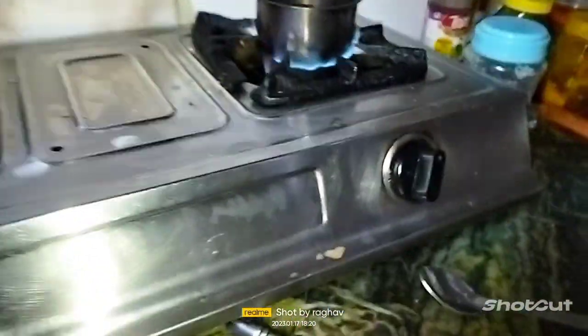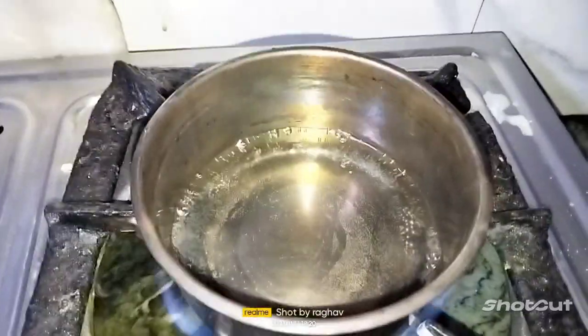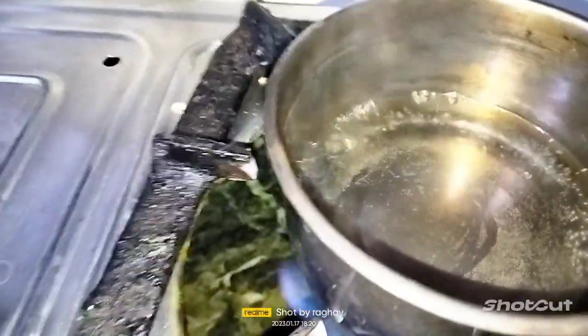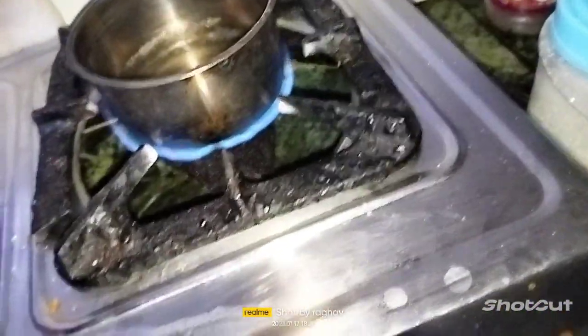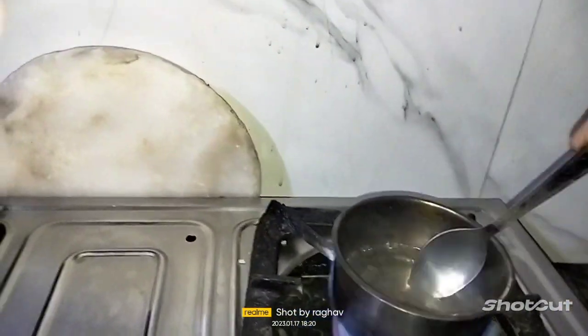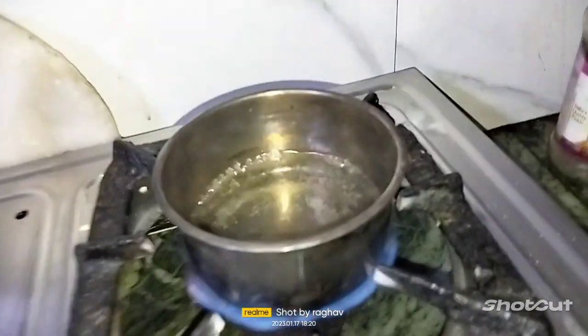Now you see. Look at these crystals formed. You can see a little bit of crystals formed. Now I put the glucose. Now I mix well. Now I kindly mix the solution. So let's see what happened.